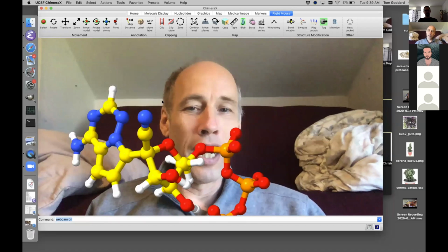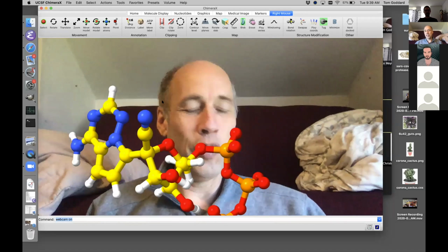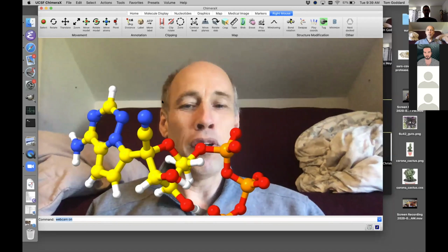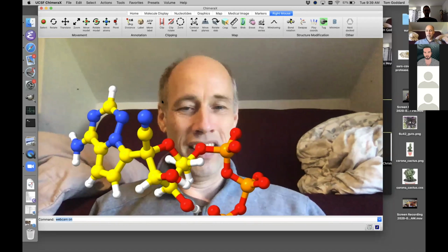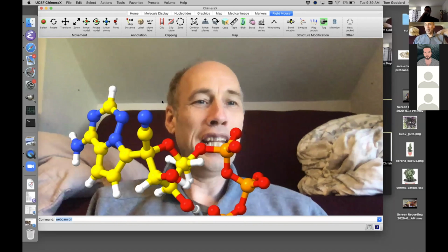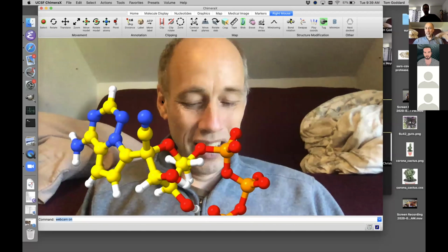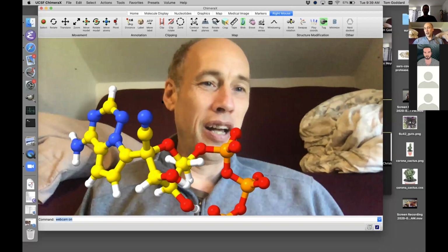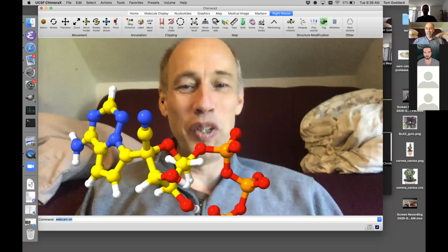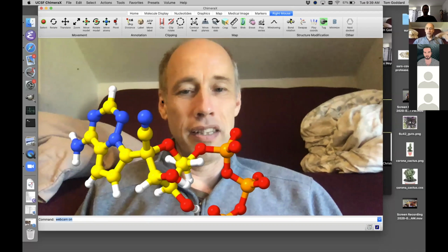I've been trying to get a bunch of collaborators interested in doing that, but I didn't have this easy method of doing it with just a webcam. A number of them said they were getting the VR equipment and the depth camera because they were excited to do it. But so far, to my knowledge, nobody has published augmented video using ChimeraX of their science results. So you could be the first, and if you do it, let me know. I think it could be a good way to present science in the future.